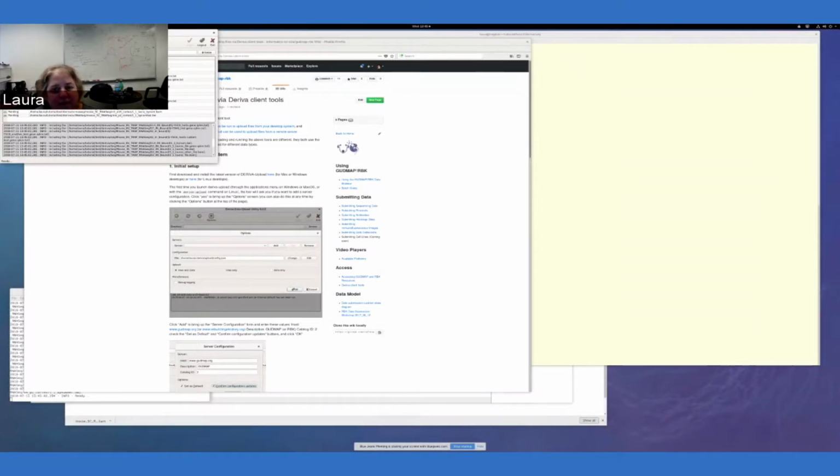So, for example, for this file, it's going to look for a study called mouse IRI trap RNA-seq. And then, since there's nothing more under it other than the file name, it's going to assume that this is a study analysis file. Going a little further down, it'll look for a study called mouse IRI trap RNA-seq.